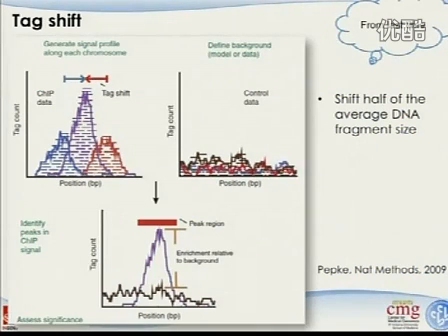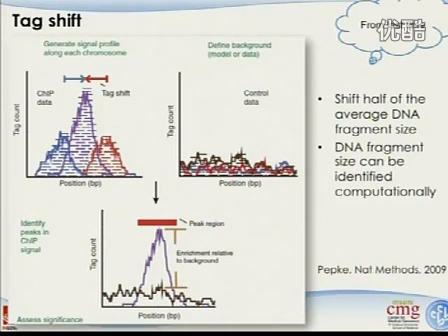So you can see in this region you can still do that type of shifting, but eventually the overall signals will be very flat. At this stage, you're comparing this derived tag-shifted signal versus the control. You look at this enrichment, and this is the way to help you identify where the binding occurred. We're still okay? And this is basically the first approach, tag shifting.